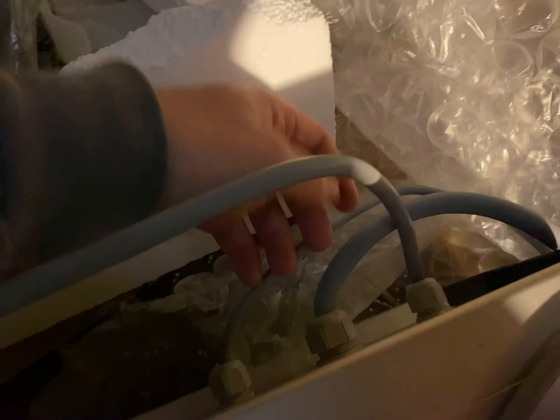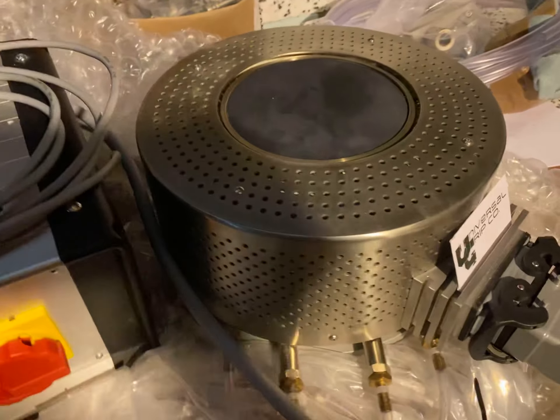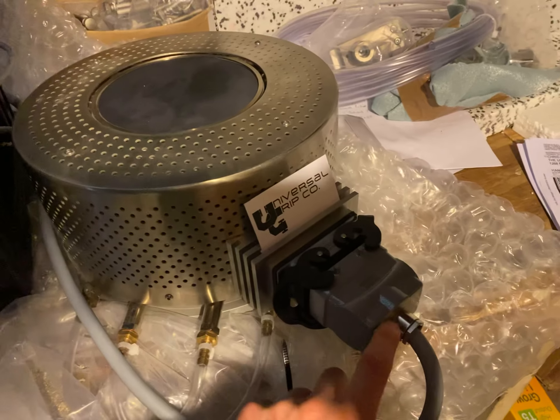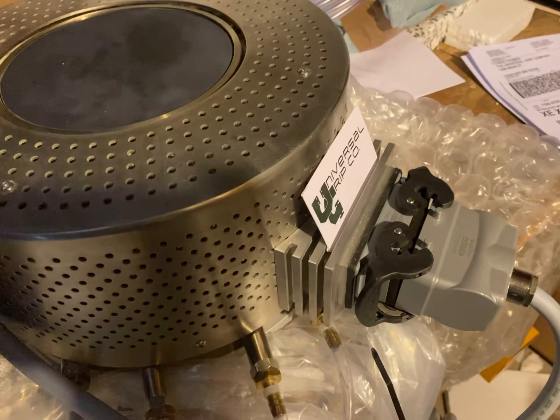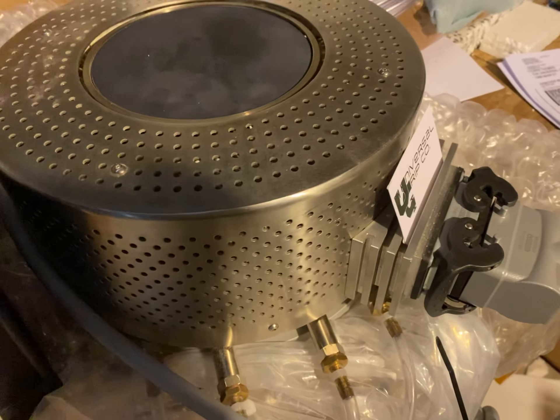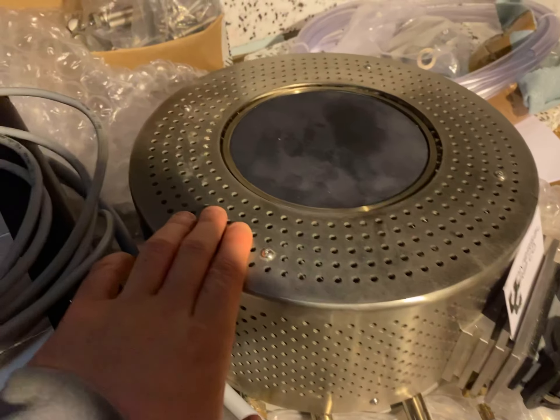You can see in the back here we have three wires. That last thick wire is the power going out to the platen — that's how it's actually heated. It connects in here with a pretty rugged plug and is also attached to a thermocouple. This one will go up to 650 Celsius.